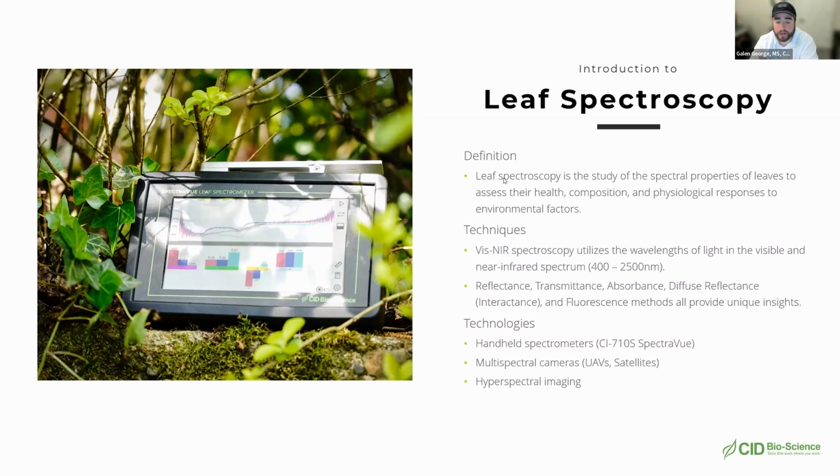What you're going to want is someone that has some kind of data science or programming experience in R or Python, so that you can utilize different features like neural networks or machine learning like TensorFlow, things like that. And so you'll need someone on your team that is capable of handling programming in that way. Other than that, it really just comes down to planning. But for more information on that process, I would highly recommend checking out that series and then reaching out to us if you have more questions.